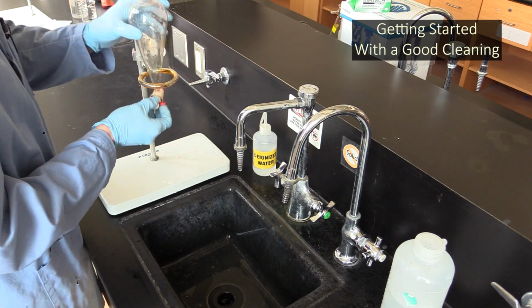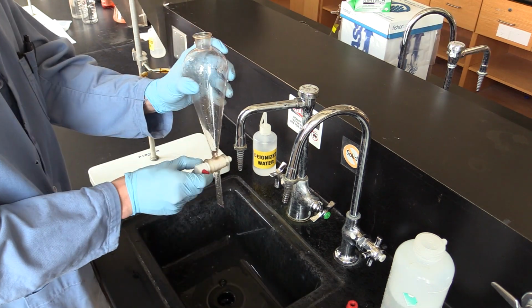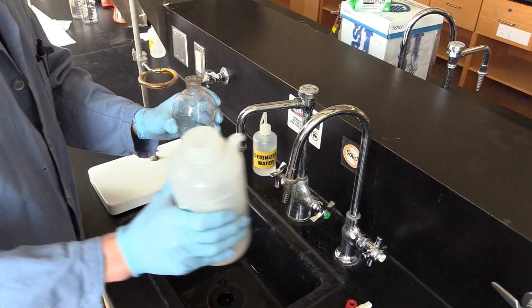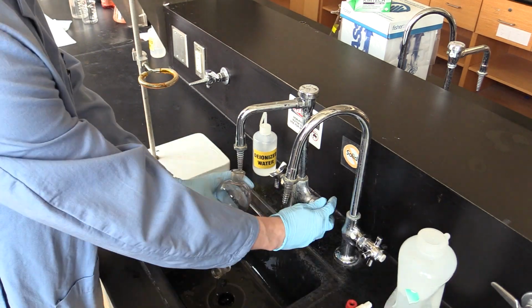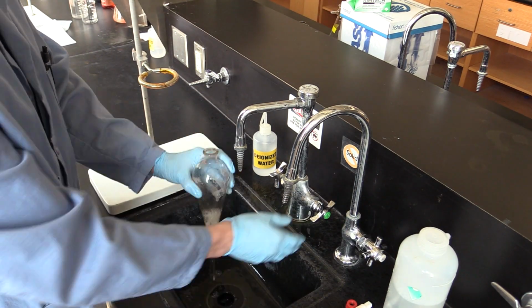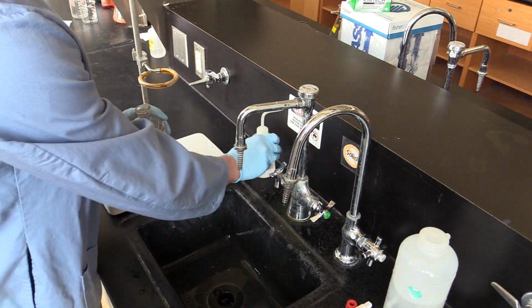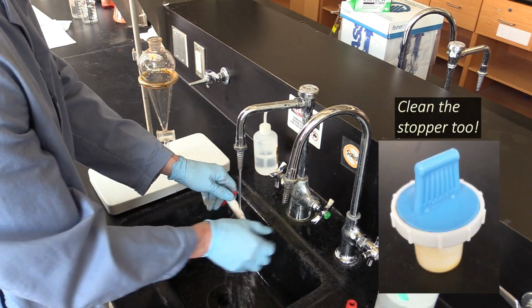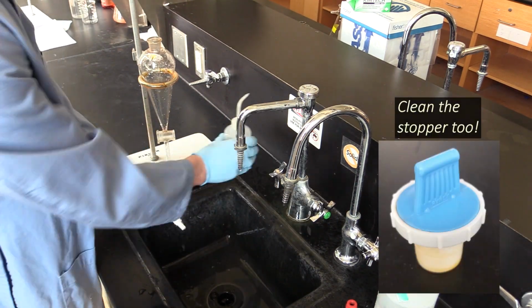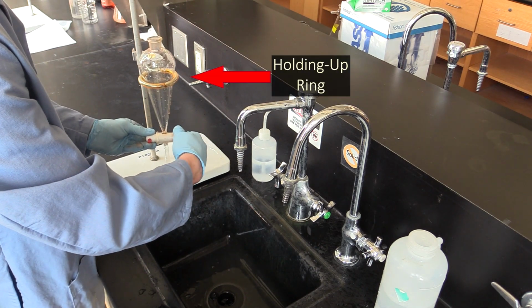Before you begin, you're going to want to dismantle your separatory funnel so you can thoroughly clean it. Wash the inside with a little glass cleaner, then rinse the glass cleaner off with some water, followed by DI water. Do the same with the valve insert to make sure it's clean too. After you've got your sep funnel reassembled, you can use an iron ring to hold it up.